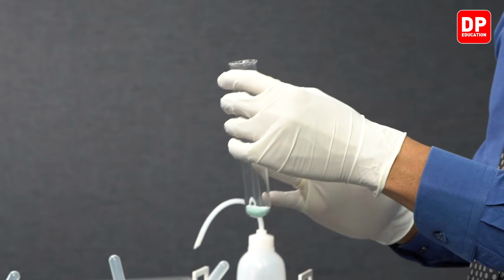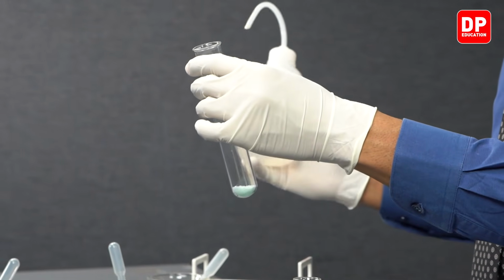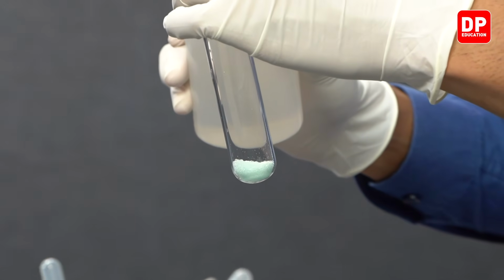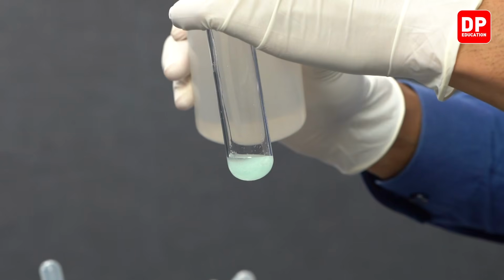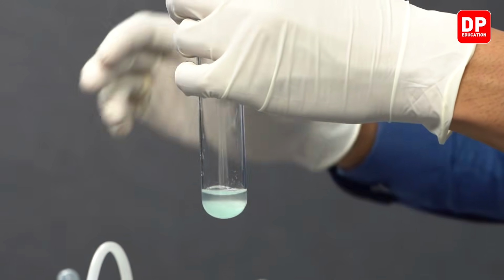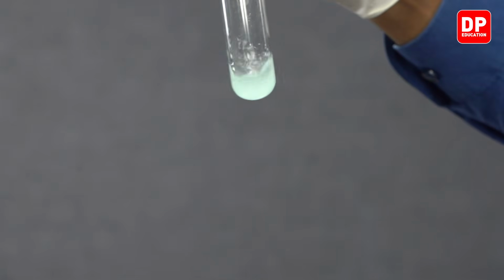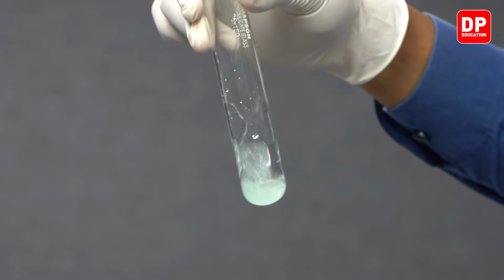So now let's add some water to this with the use of our wash bottle here. We'll add only a small amount of water because we intend to form a saturated solution of ferrous ammonium sulfate.